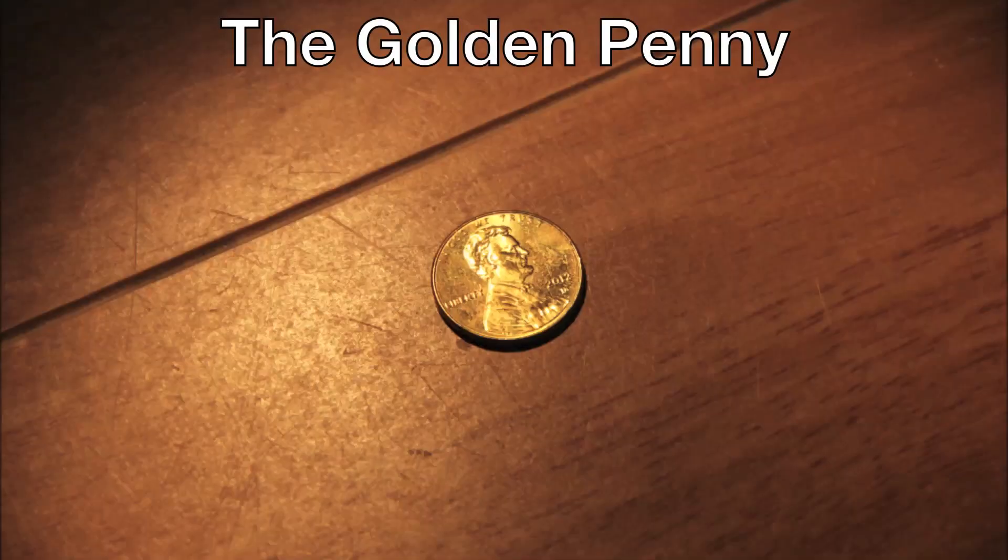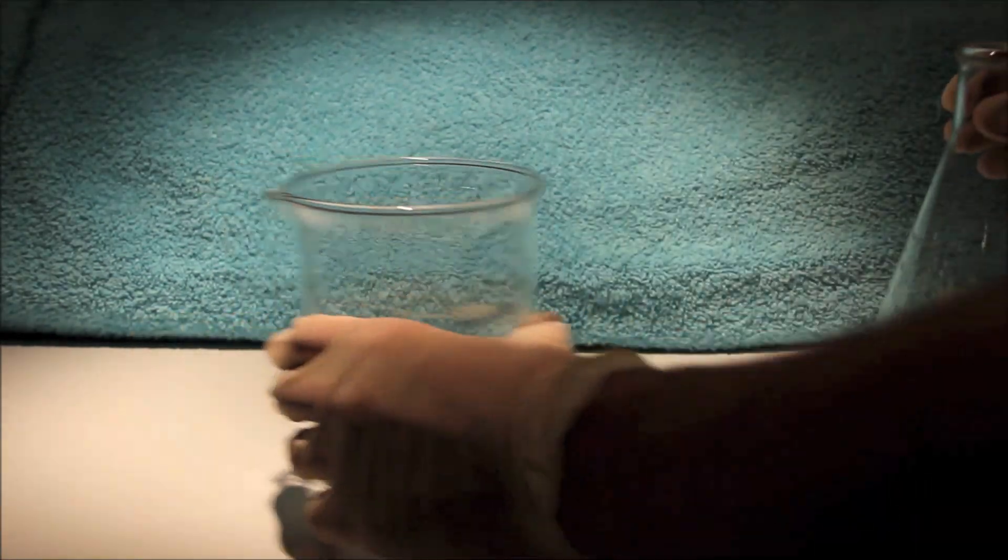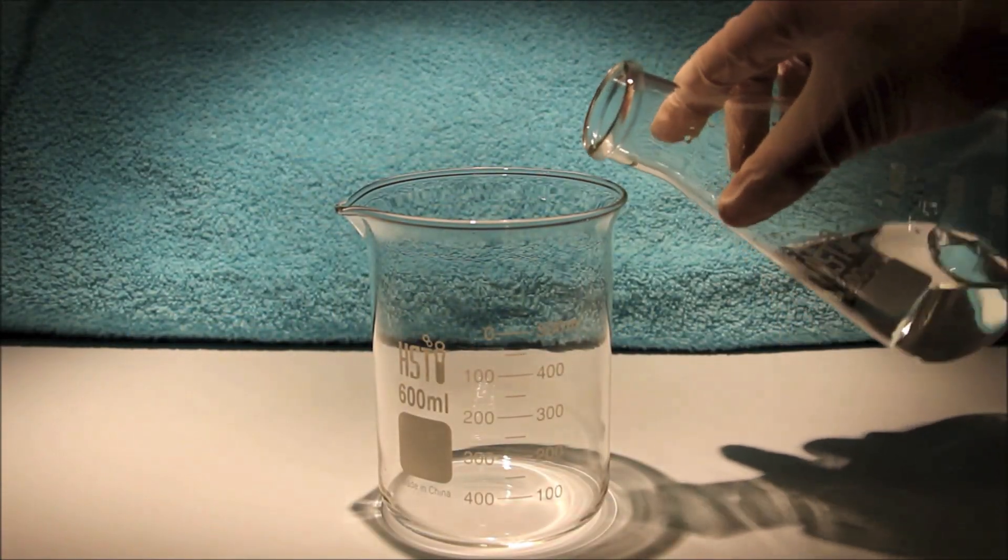In this part of the video, I'll show you how to make a penny which seems to be made of gold. Here I have the original solution of zinc chloride produced in the first experiment, and a beaker to transfer the solution to.